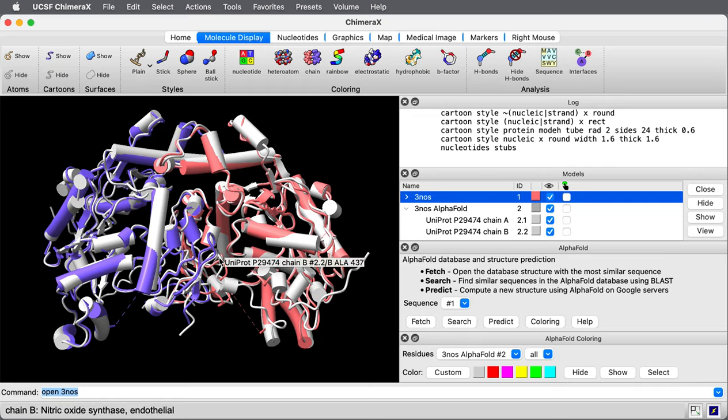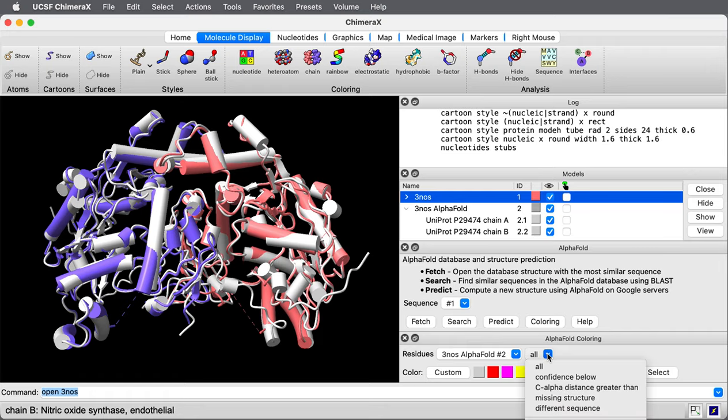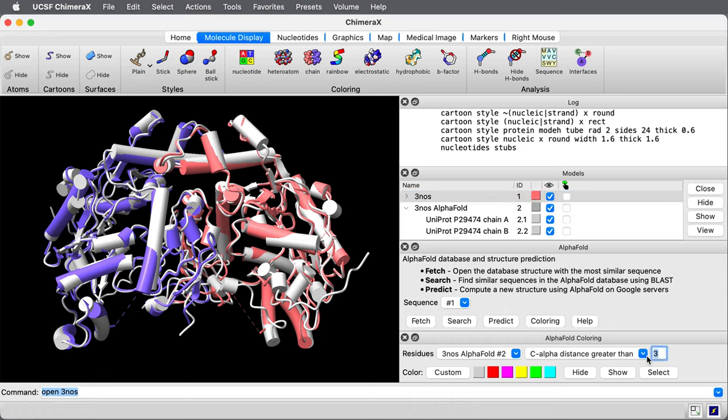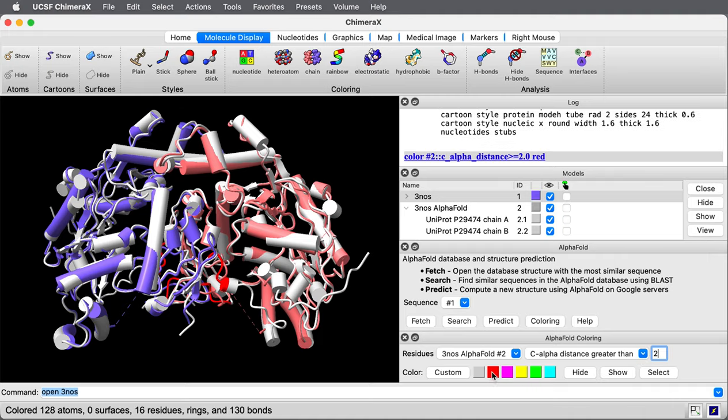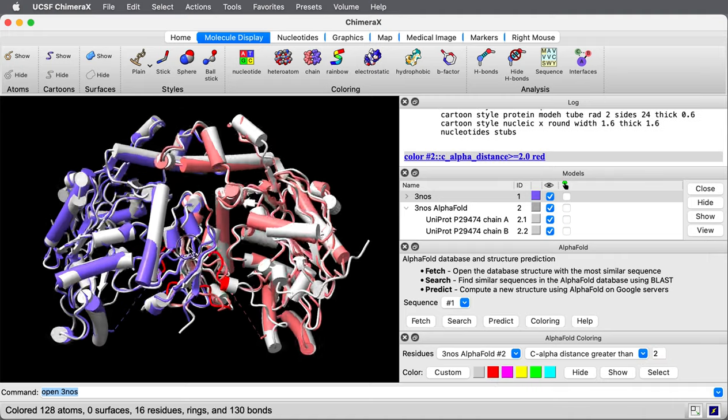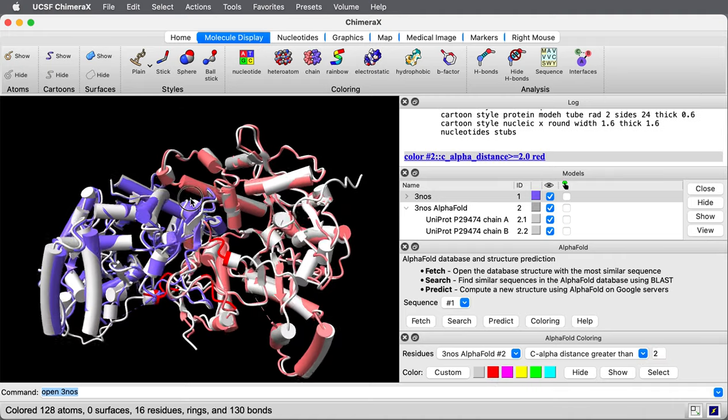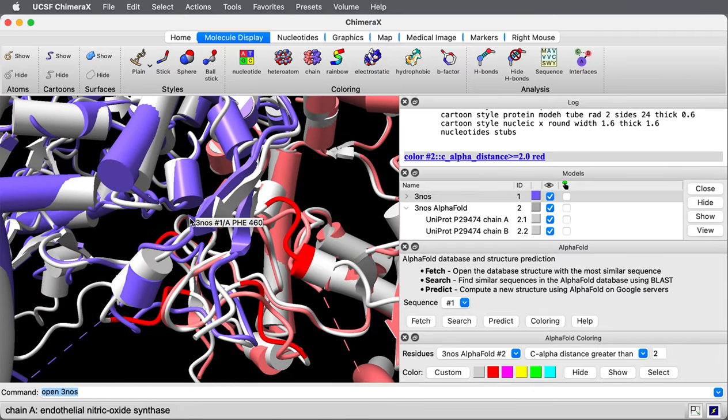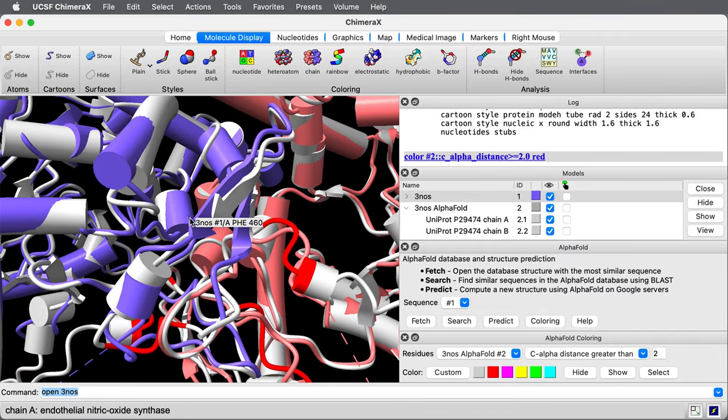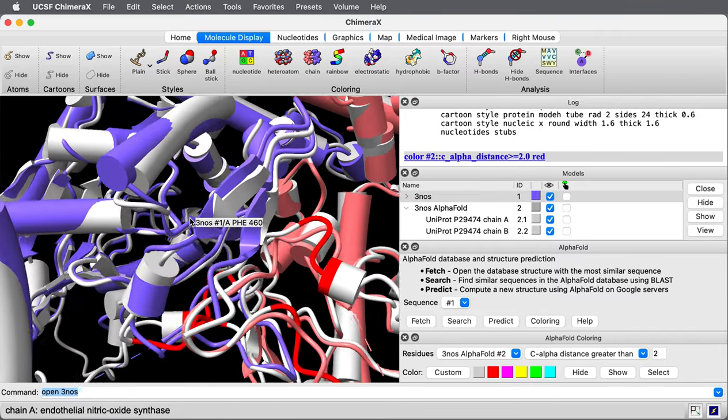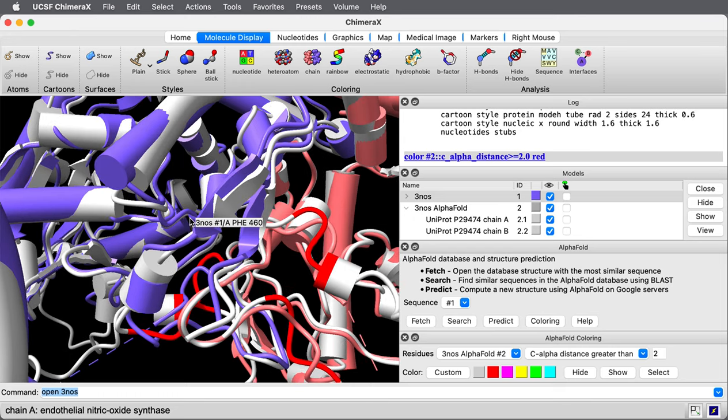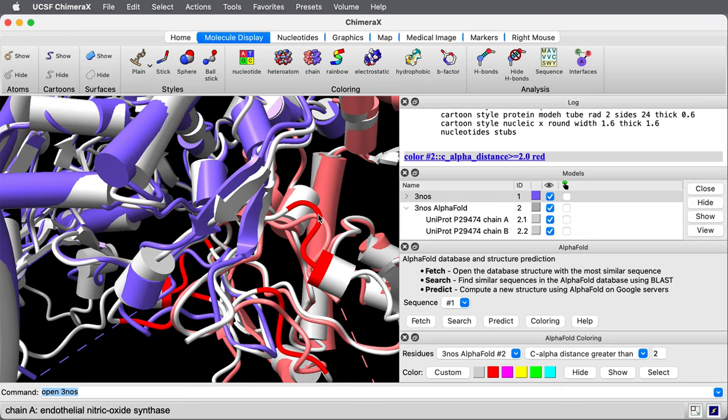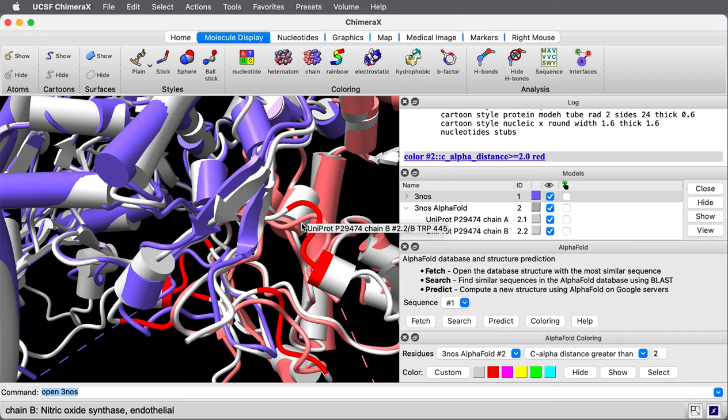Now let me try to color the regions, the residues where the two structures differ. If I go to the coloring panel, I can choose from this menu the C-alpha distances between the two structures greater than three angstroms. Let me change it to two angstroms because these structures are very close. Then I'll press this little red color square to color red just those residues.